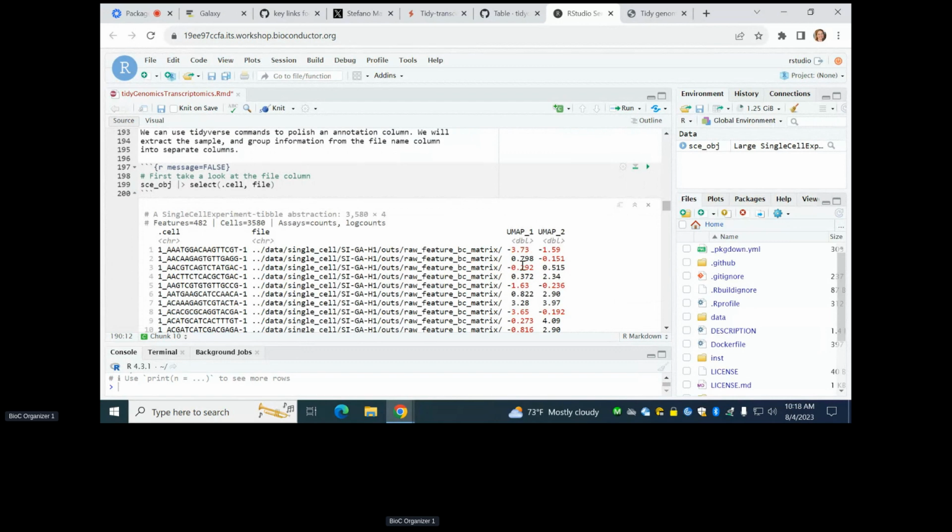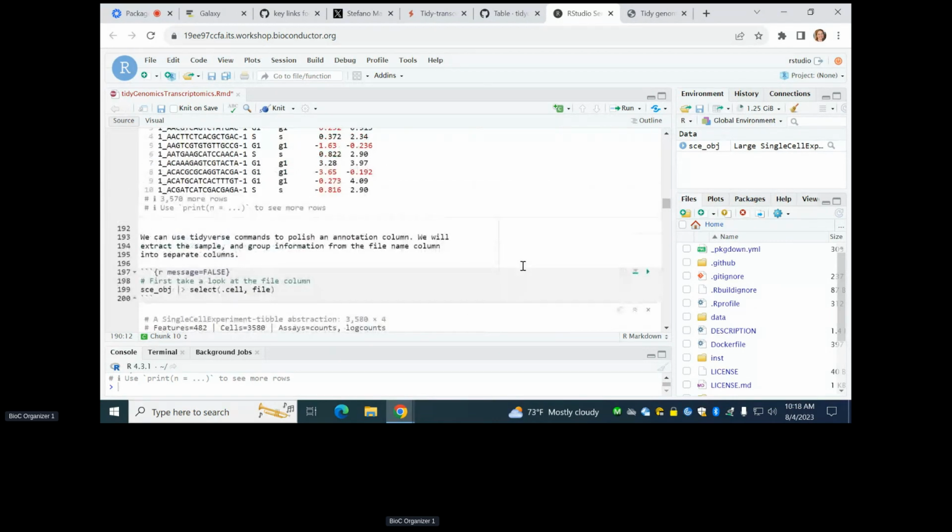Why are the UMAPs there, if you selected things that are...? Because those columns are view only, so they will be there. In the future, we will make this visually a bit more explicit, but basically, UMAPs are grabbed from the object and displayed. Since they are view only, you cannot select them out because you would drop them from the object in this case. So if I had lots of other reduced dimensions, would they pop up there? Yes.